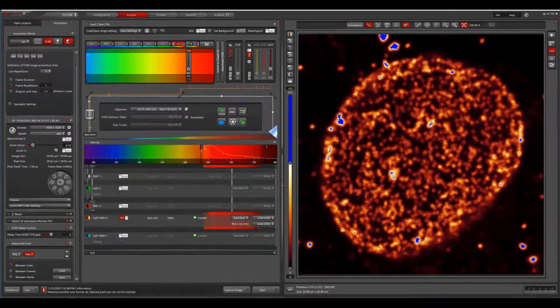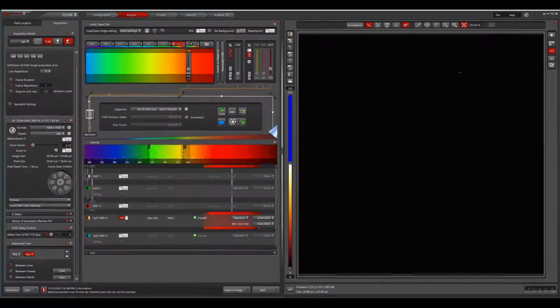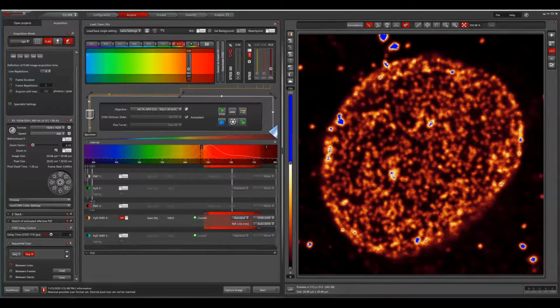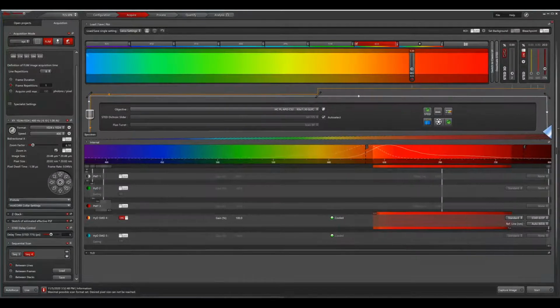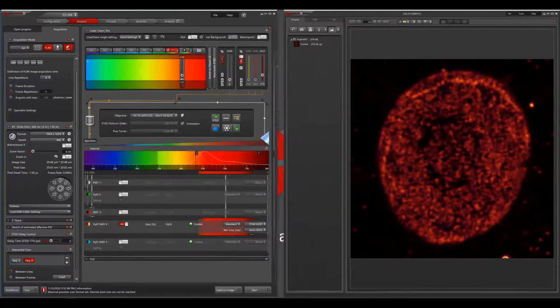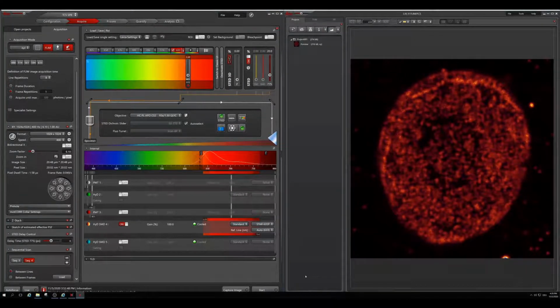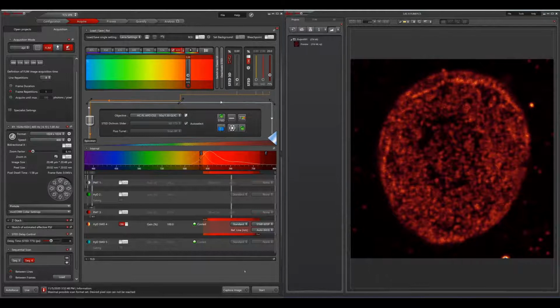All right, now I will put both windows, which I have here in front of me, on another screen, side by side on the same screen, so that you can also see them. I will remove the viewer from the main window and make it a bit smaller and put it side by side with the FALCON window, which normally, as I said, would be located on a separate screen.